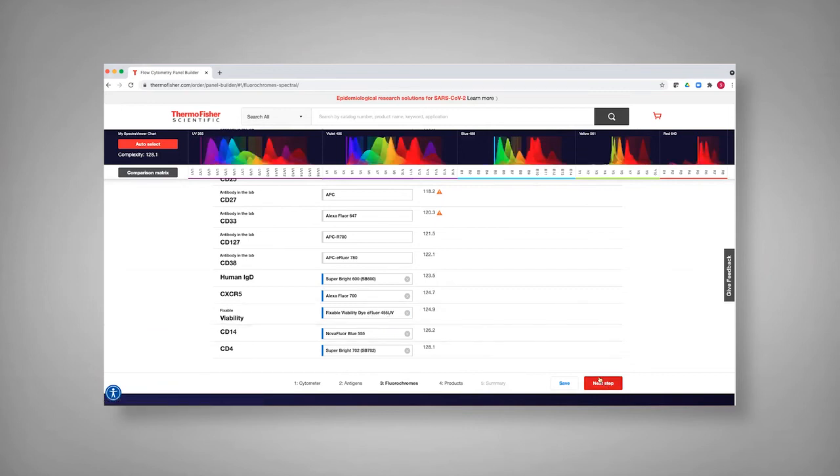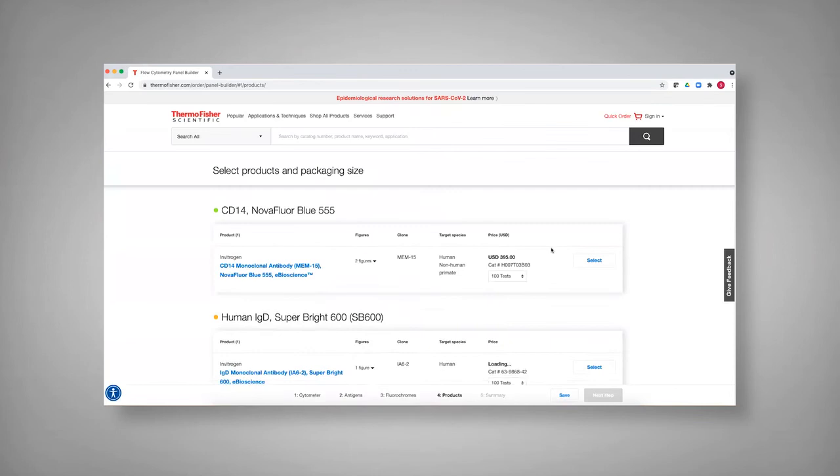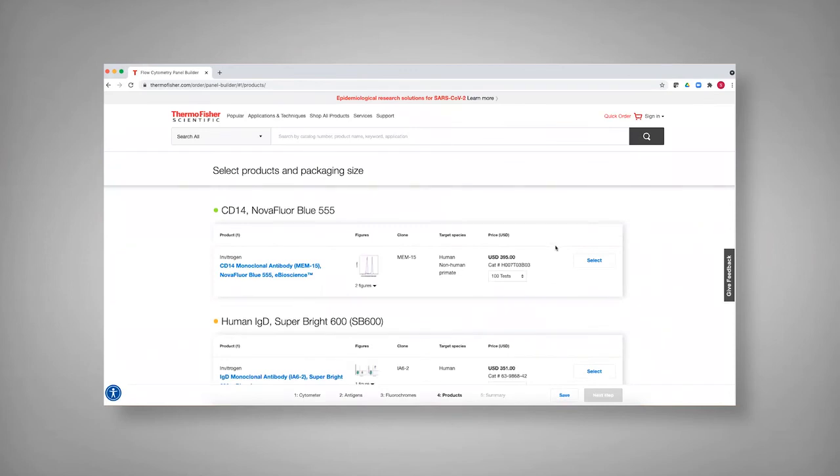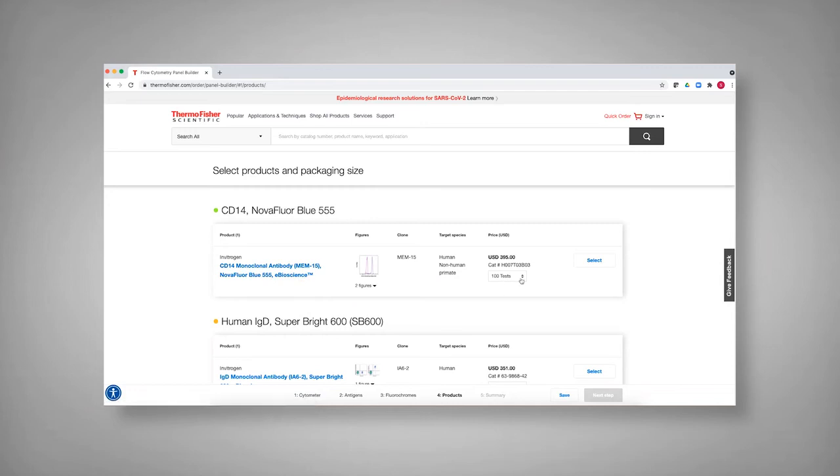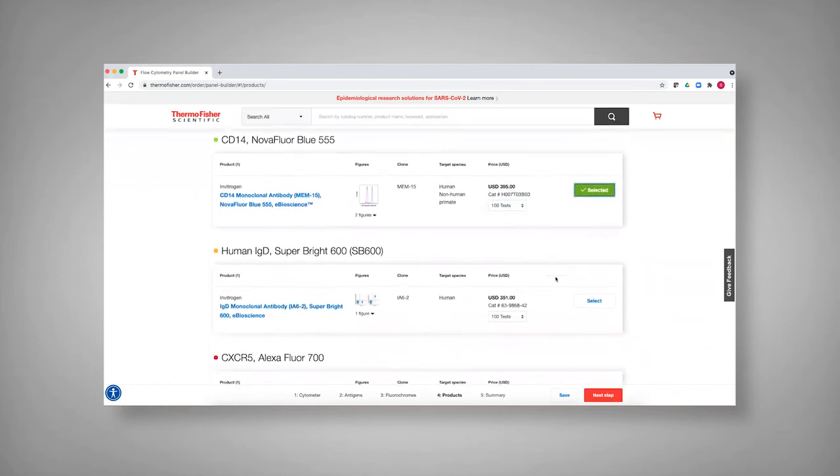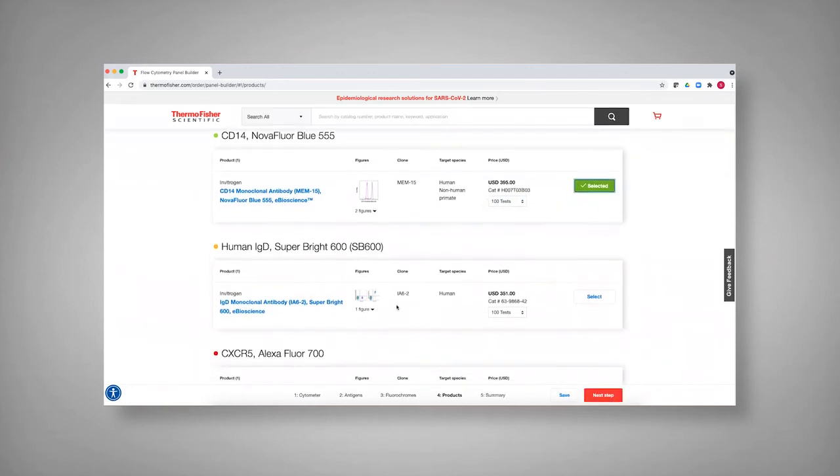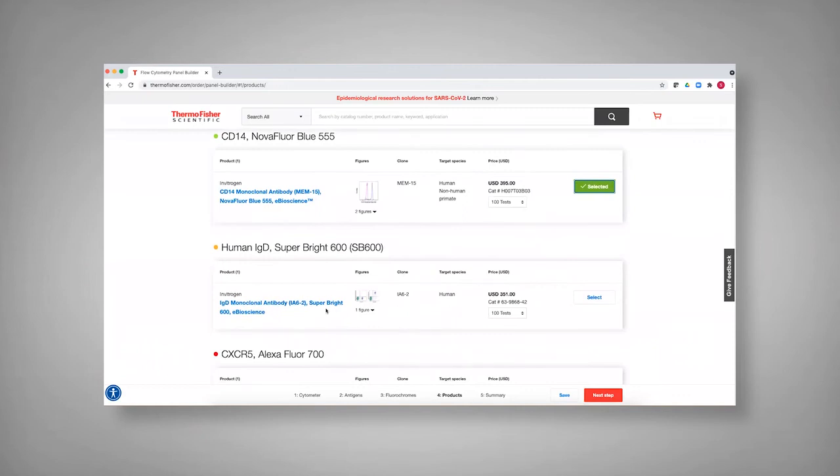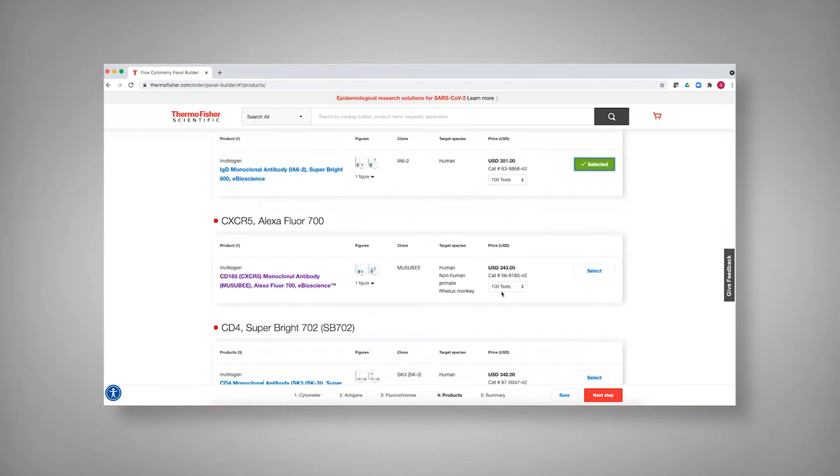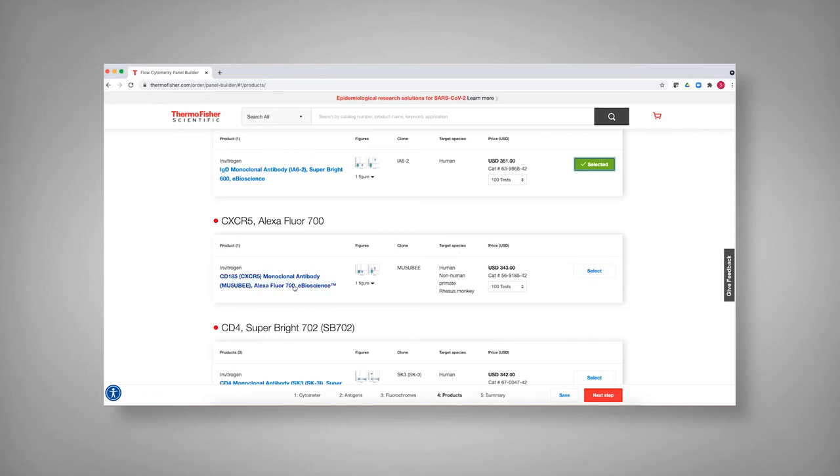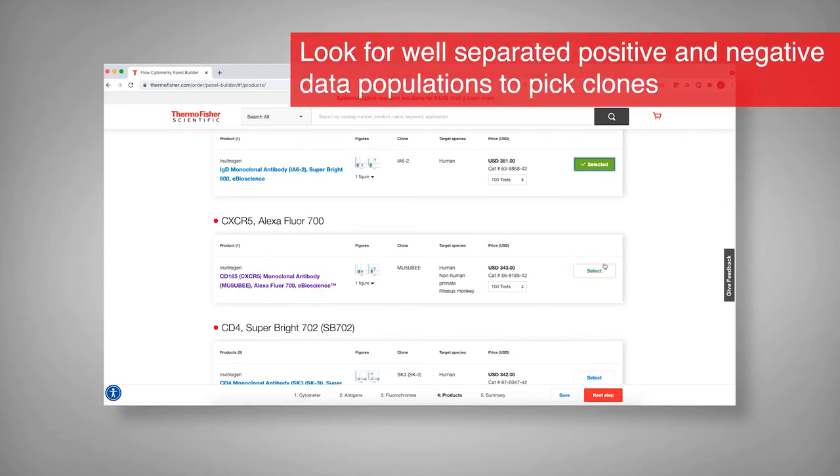And so in the next step, because it says that you already have these antibodies, you can go through and select what you might want to have. So for instance, here, it's recommending CD14 in the blue 555. And you can see, you can select either 100 or 25 test versions, and then select what you might want to purchase. You can see here that since it has selected the super bright 600, then you could select here. And then again, you might end up switching the super bright 600 into the CXCR5 because you really need that brightness. But if you went with what it was suggesting, this is what you'd select. And again, you can see which test case you want.